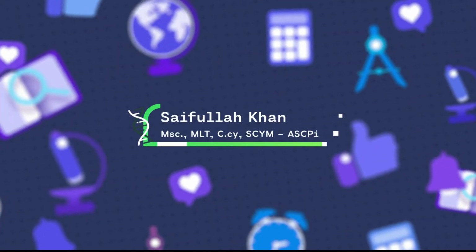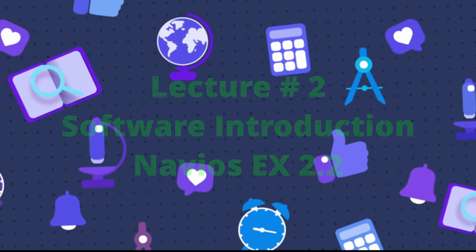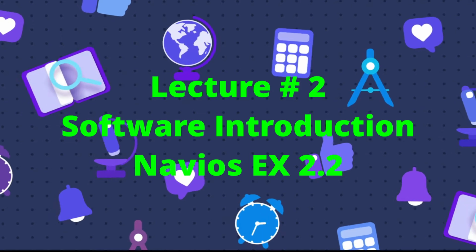Today is the second lecture for flow cytometry, and in this lecture I will tell you about the software of Navios EX 2.2.